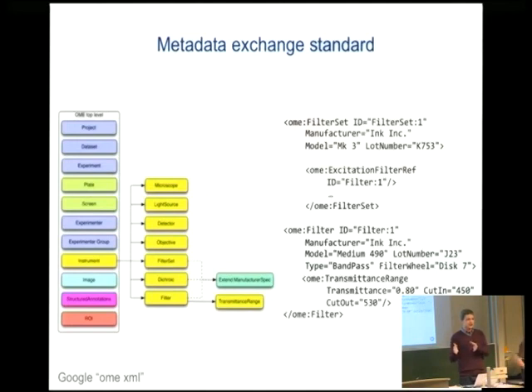So if someone exports, let's say, a Nikon proprietary file format into OME-TIFF, they can give this image to any scientist that wants to see it, and if that scientist works either on OMERO, which is the product that we provide to users, or any OME-aware piece of software, they can instantly import that image and not lose any data on the way, and work with it without being fenced into this specific format.